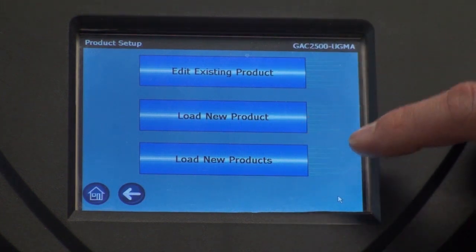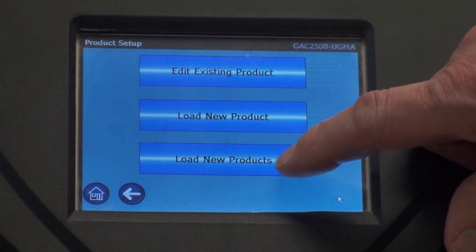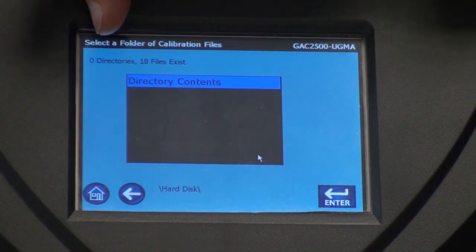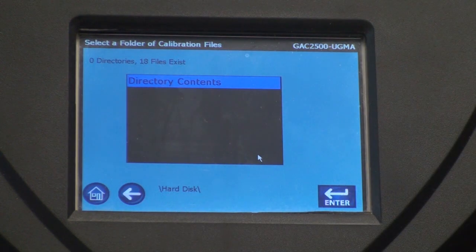To load all the products on the USB drive, you would choose the lower button which says load new products. It now says that there are 18 particular files on this drive, so it reads all the calibrations that are on this drive.